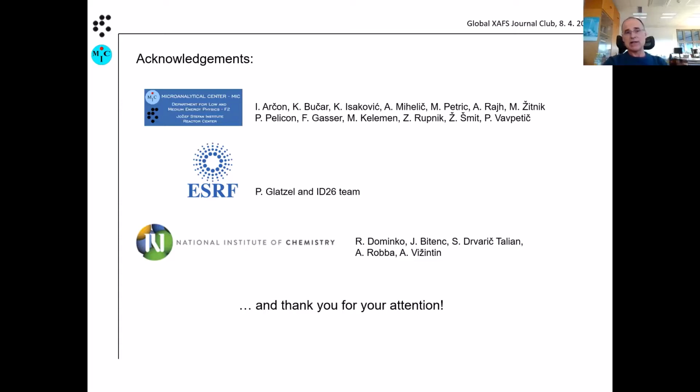So I would say it might not be that critical. So I believe one could maybe use also the Johann, but for sure, Johansson is a better choice because it gives you more flexibility. But I have seen the spectra from Jerry, we have compared sometimes, and I see no problem. So the resolution is okay, and they use similar crystals, so similar angles.